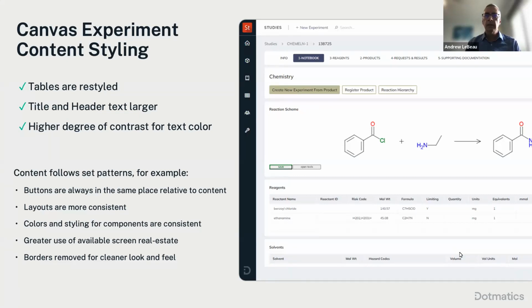There are best practices in the industry. We were already doing better than the best practices, but we've enhanced it even further to make readability of the text on the screen as simple as possible. And again, this is important because you're not always sitting directly in front of your laptop. You could be in a lab looking at a large monitor from some distance. And so that contrast is really important to be able to consume the information on the page.